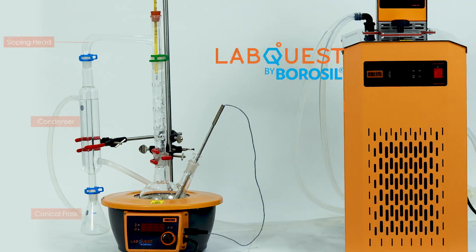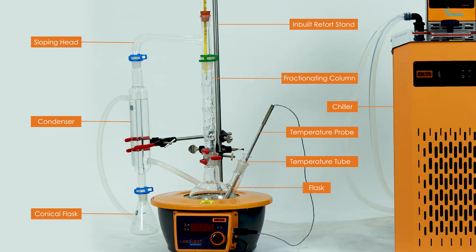Apparatus required for fractional distillation process. Use Borosil compact glasswares with the GMC for more precision.